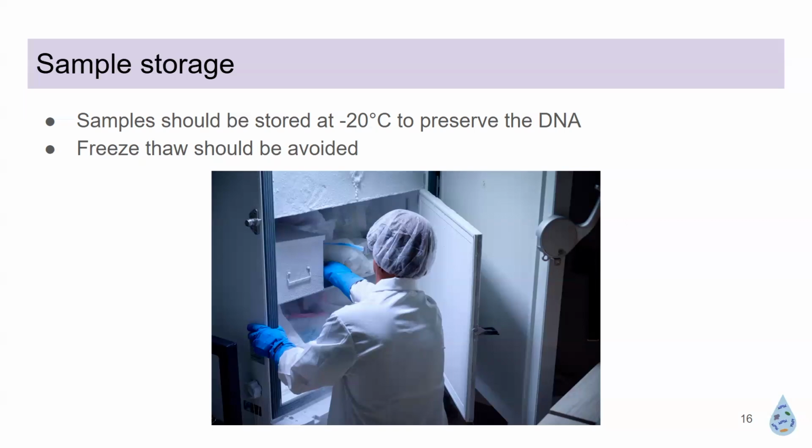Yeah, I've seen people doing stuff in smaller volumes, trying to detect fishes from field samples. Yeah, if you're targeting your eDNA sample, then you can go for smaller volumes. If you're doing metagenomics, it's best to collect a greater volume. That's the recommendation.